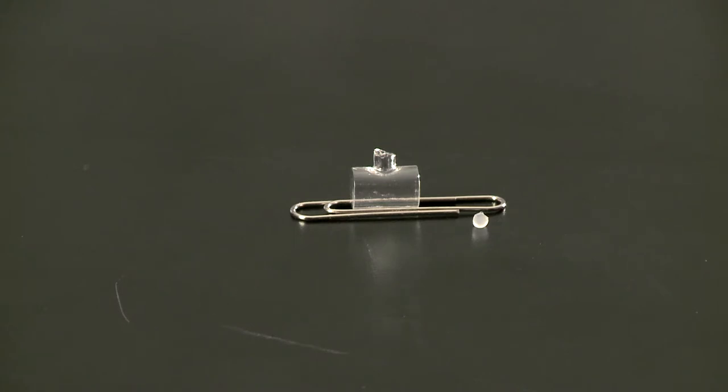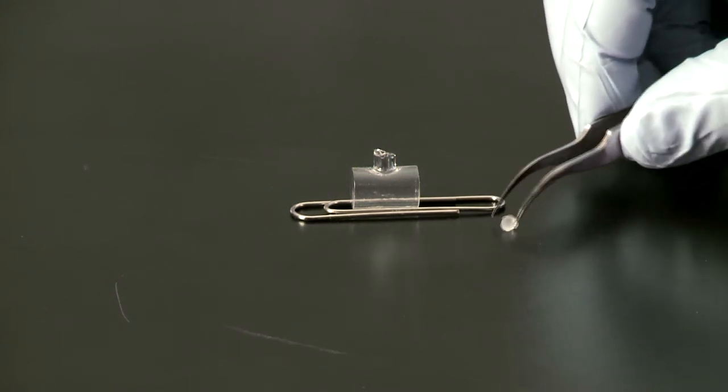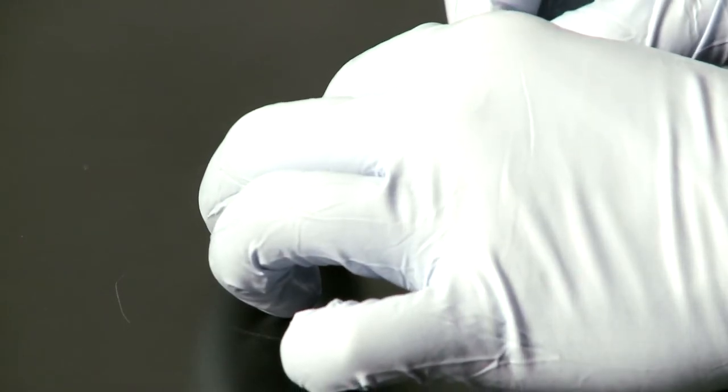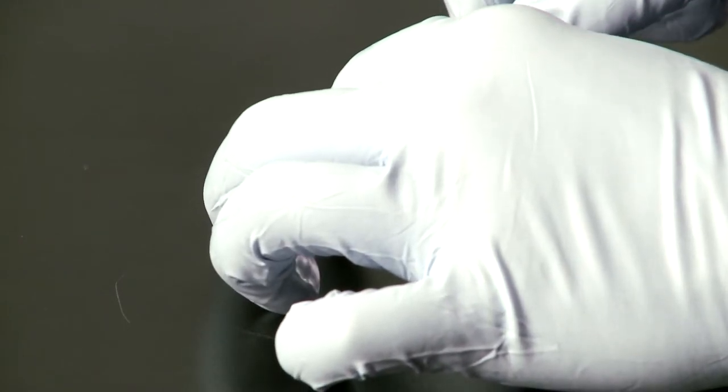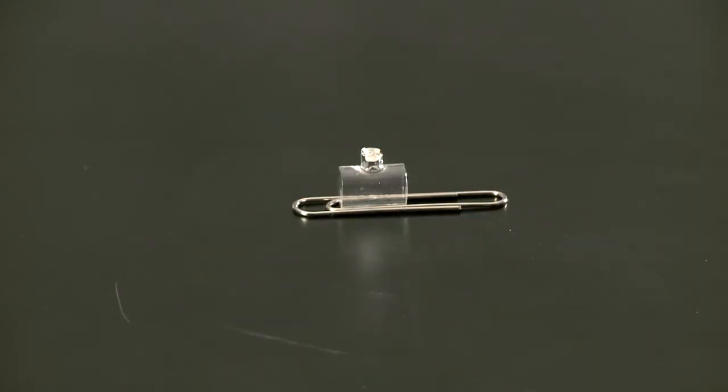The first thing you would do is weigh out your sample and then place the rubber stopper inside the ampule, and then you would re-weigh your sample. Once you have your sample loaded, place the stopper in place and weigh it like that to get the weight of your sample.